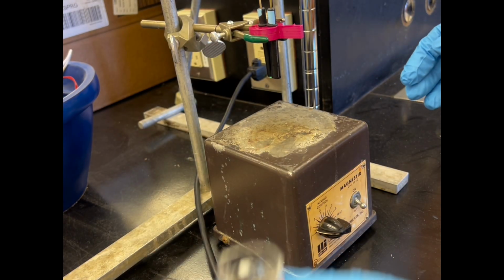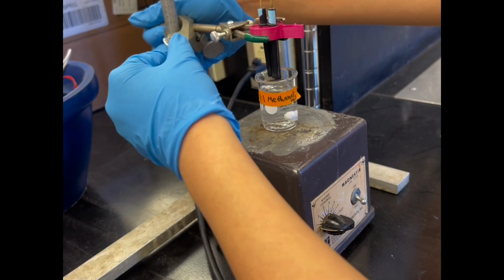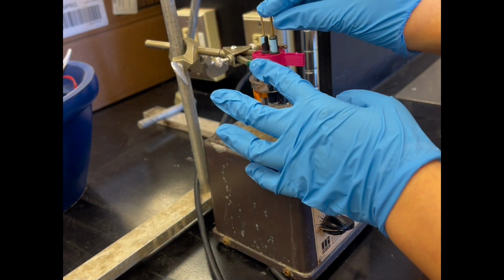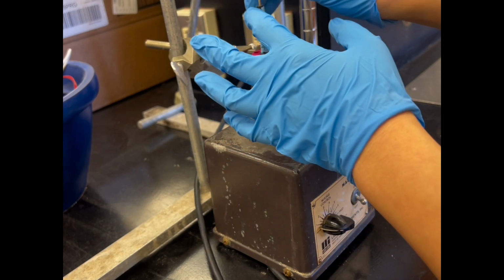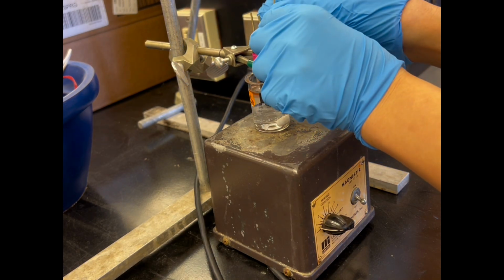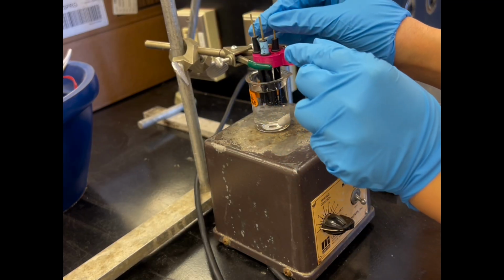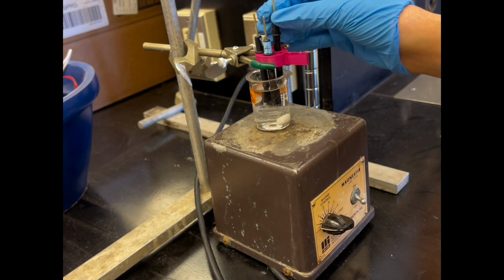In this step, it's better to make sure they're at the same height and they're definitely not touching the stir bar. The stir bar is in the middle or at a similar distance from each electrode. Like it's not getting close to one of them but very far from the rest of them. So we could make sure that their template is removed equally.